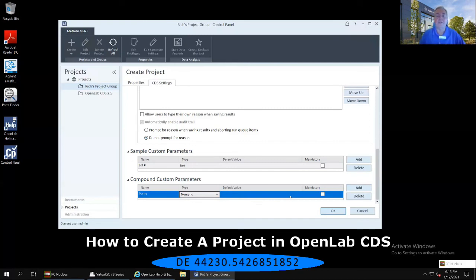Well, the system equilibrates for 30 minutes, and then at 5 o'clock, she's already halfway out to her weekend, but a dialog box of 100 big red X's appears, looking for this mandatory custom field parameter that was not filled in. And unfortunately, the system tried for 30 minutes to resolve that error, couldn't, and it errored out with a not ready timeout.